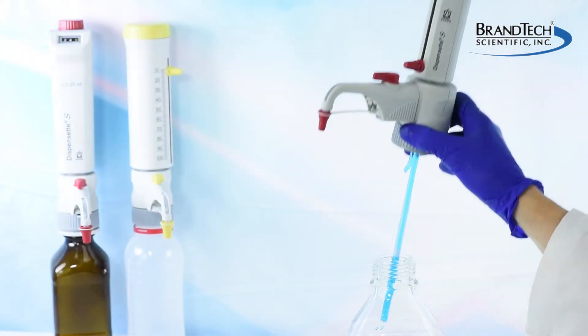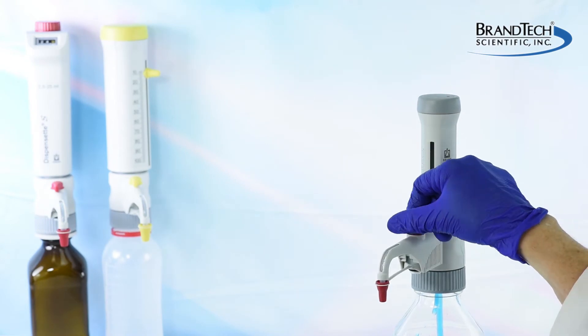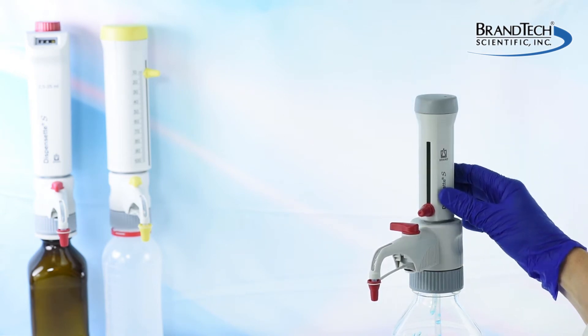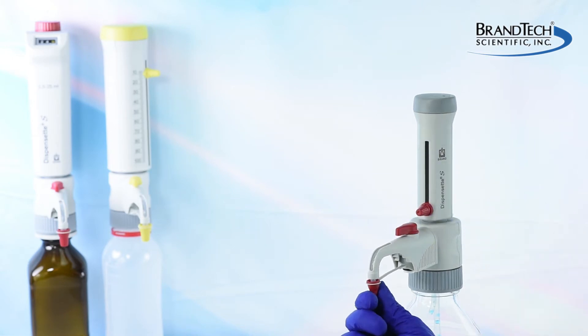Remove the Dispenset S from the reagent bottle and attach to an empty bottle. If the instrument has a recirculation valve, turn it to recirculate to flush the remaining reagent from the dispenser. Then turn the valve to dispense and purge the remaining reagent from the discharge tube into a waste container.